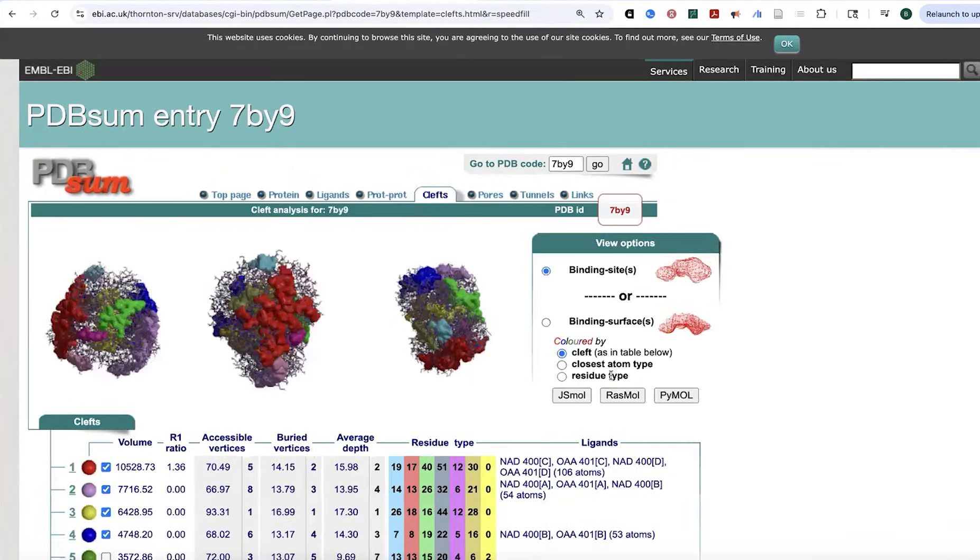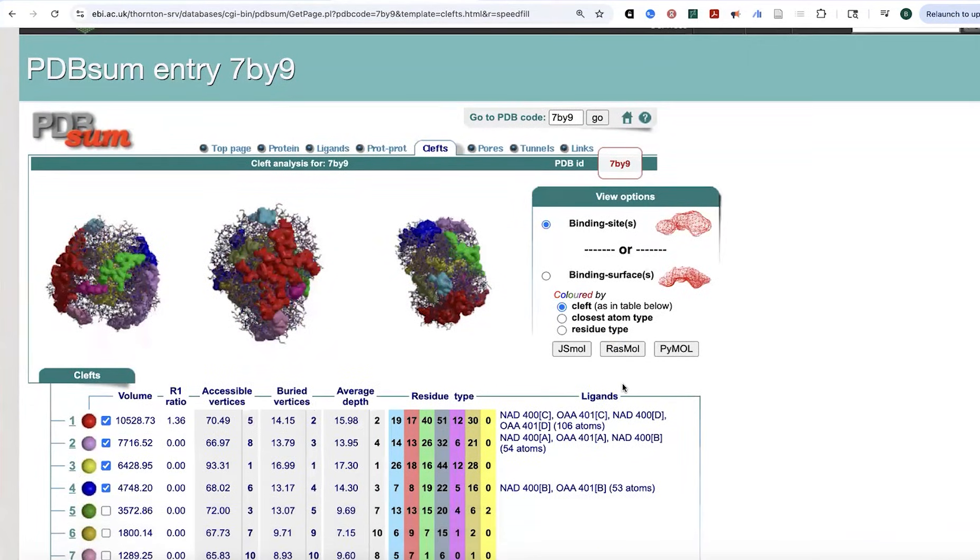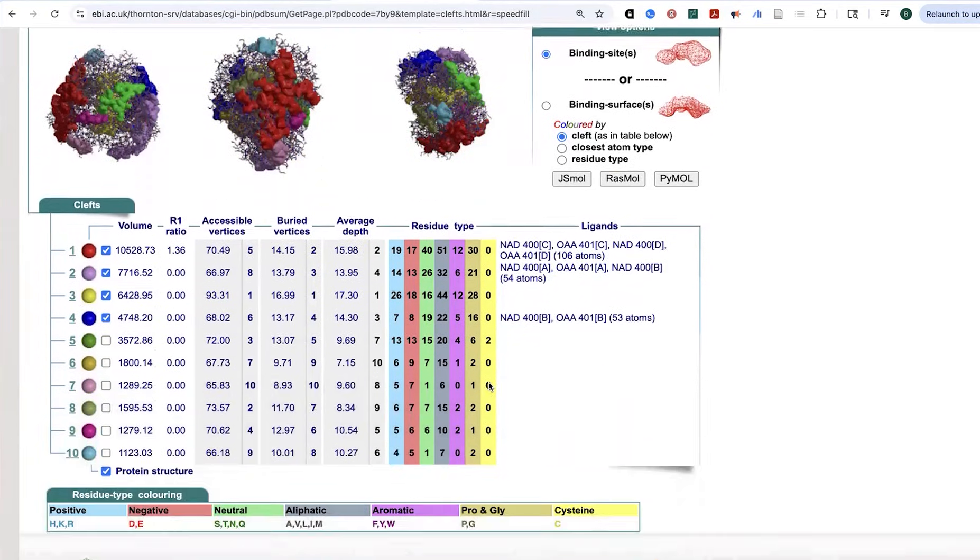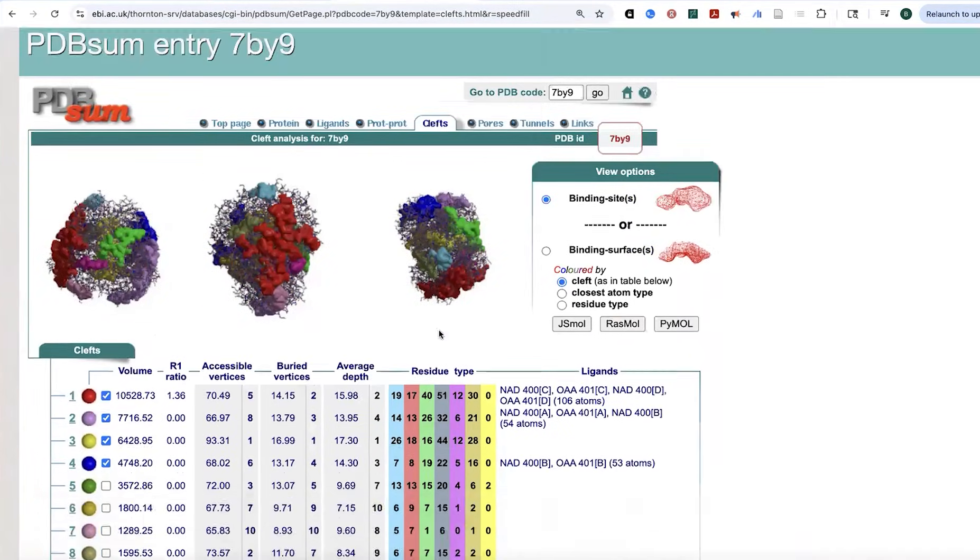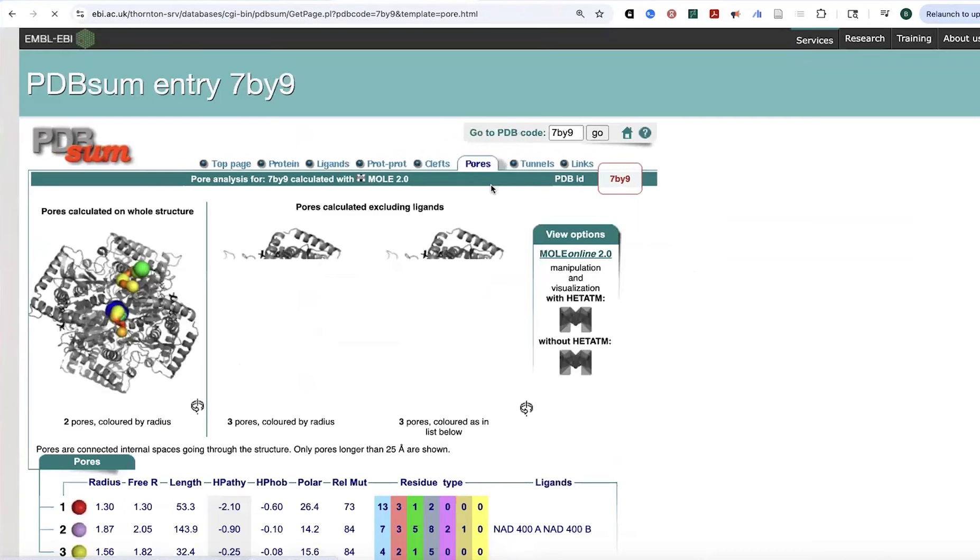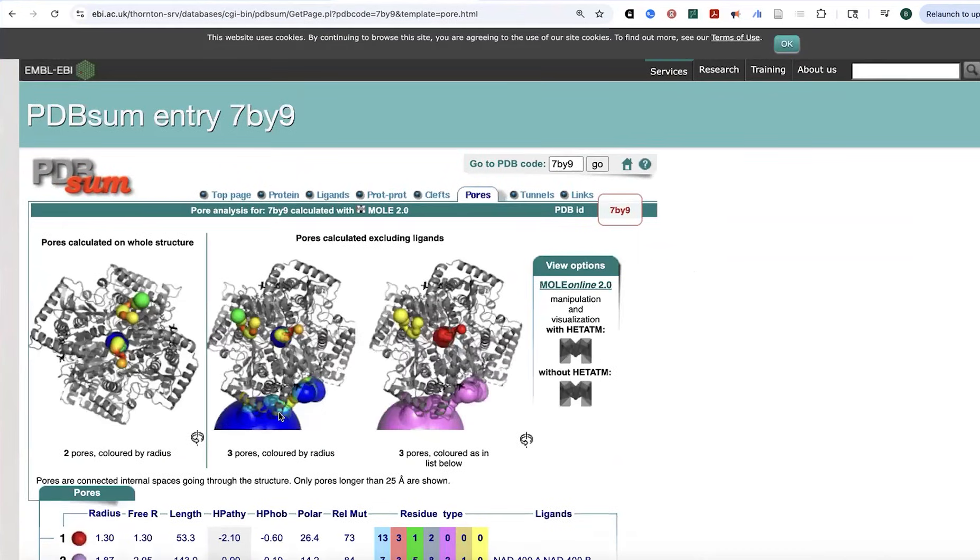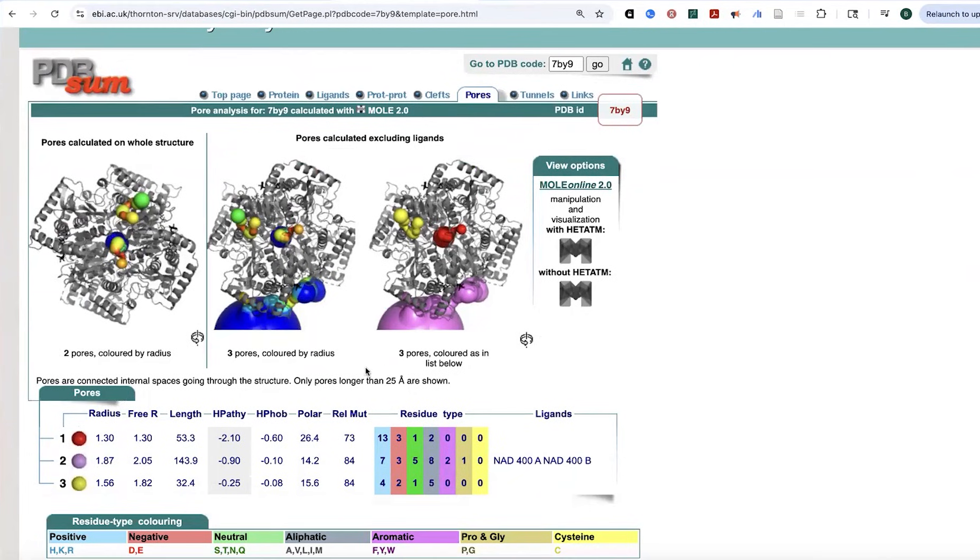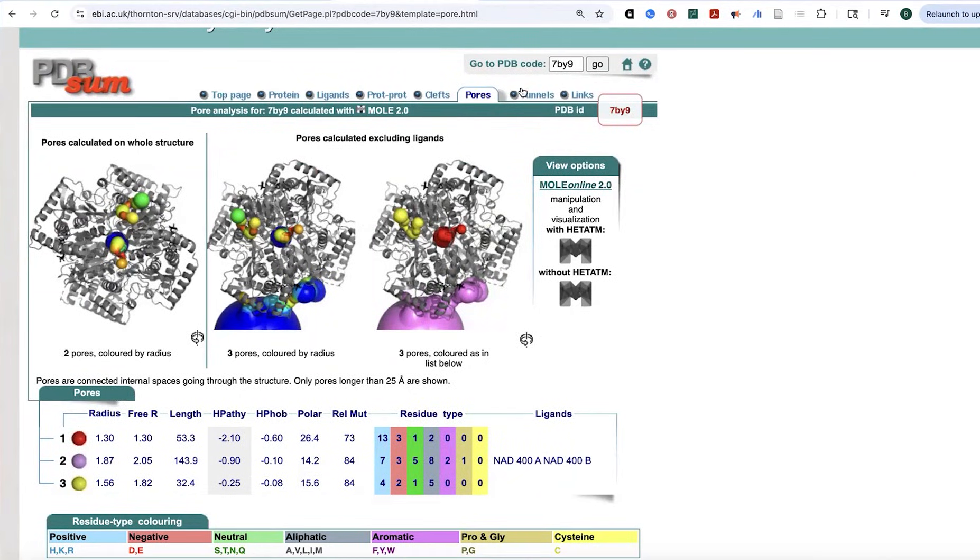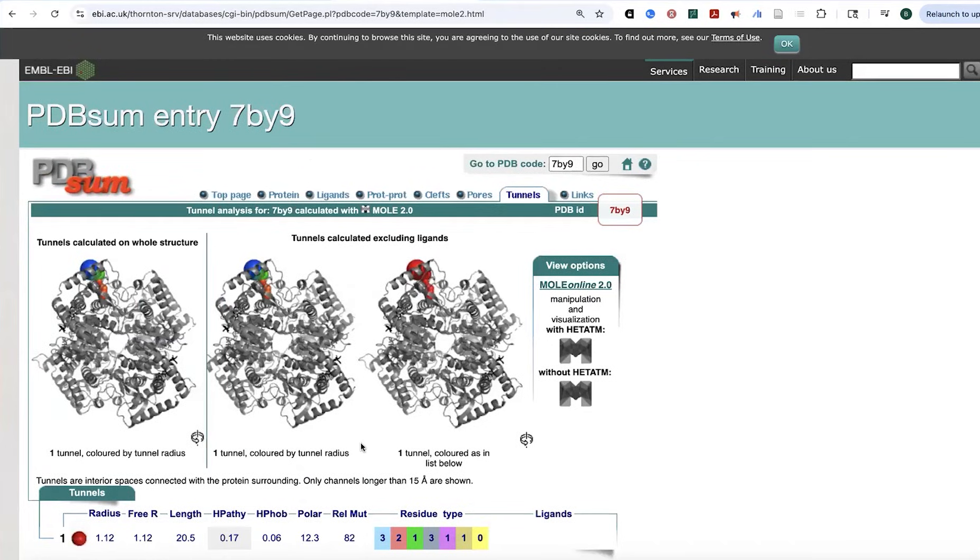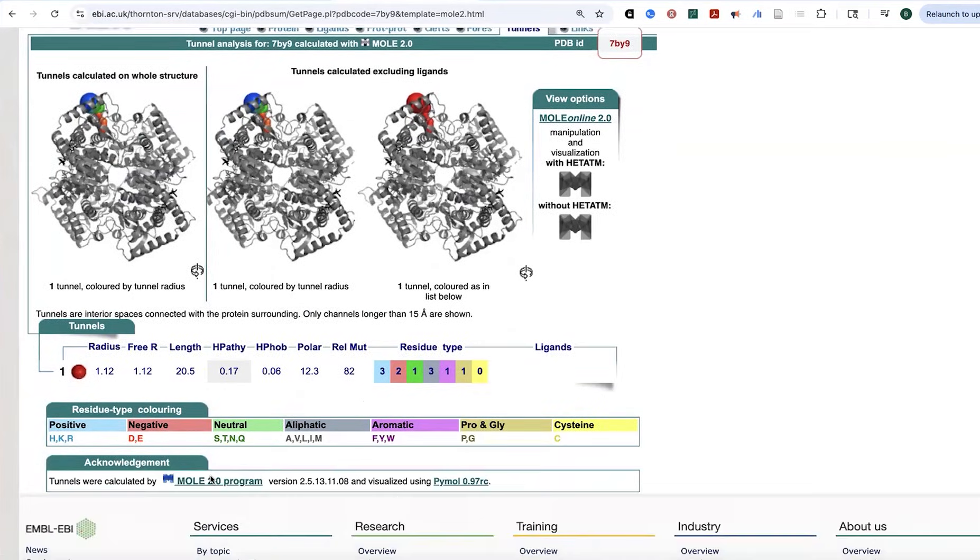Now let's look at the presence of things. Now let's look at kind of like the absence of things, those spaces in the protein. And so they can have these kind of like shallow clefts, binding sites and things like this, as well as pores, where they're connected to internal spaces going through the structure. So those are going to be longer pores. And then you can have tunnels, which are going to be interior spaces connected with the protein surrounding.